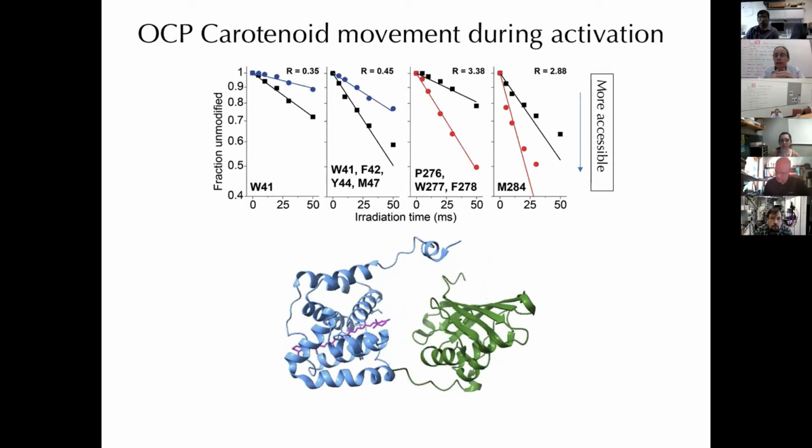So this is trying to give you an example of how you can use solvent accessibility information to get structural information.